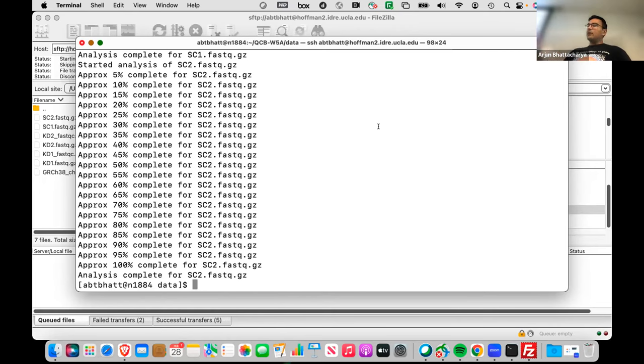So that's how you iteratively look at running quality control. It's a lot of massaging of data, and it's an iterative process from quantification down to normalization and, I guess, batch confounding.